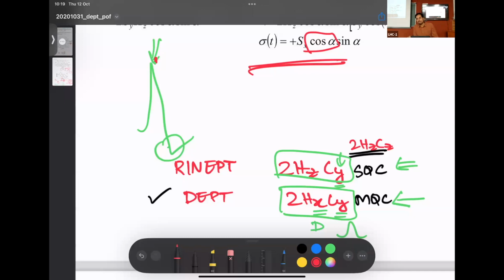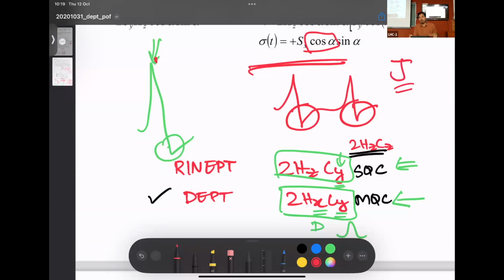Distortion, as in the thing you were adjusting that day. That's correct. And in this INEPT case, it cannot be adjusted. In a regular NMR, phase distortion happens for all the peaks, and therefore you can correct for all of them simultaneously. We will see that in the hardware part. Here, the J delays are misset because you have to take a compromise, and therefore these phase distortions can never be phased out. It will be phased out differently for different J couplings. You can't process it that way. Yes, exactly. You can clean up for some, not for the others.